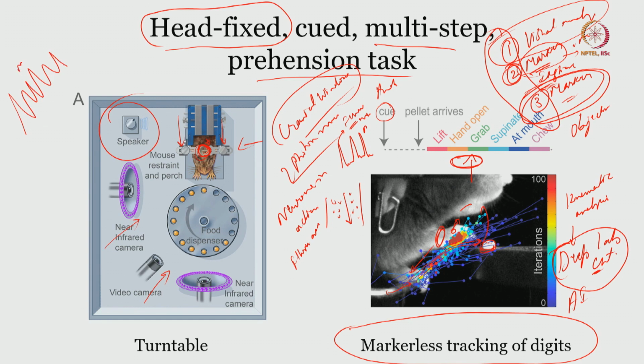These neural signals are on the time scale of milliseconds, and your video steps are probably in milliseconds and microseconds. When milli and microsecond time scales are involved, it is all the more important to have higher frame-per-second video capture and a higher shutter rate in the camera.